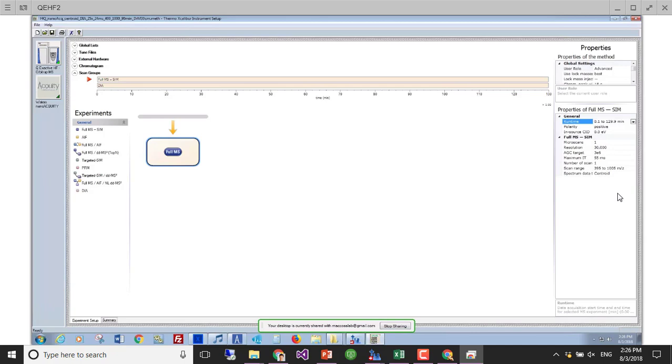Whereas accurate MS1 information is really critical for DDA, where you want to know this is the exact mass that I'm triggering on and I'm not co-isolating with another peak, basically. Does that sort of make sense? Because that's literally all the quantitation information you have, only in the MS1 scan.